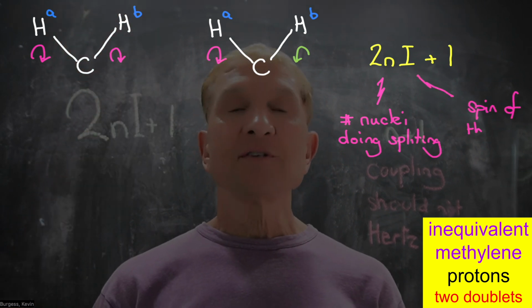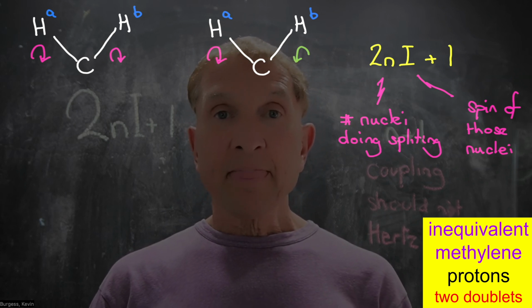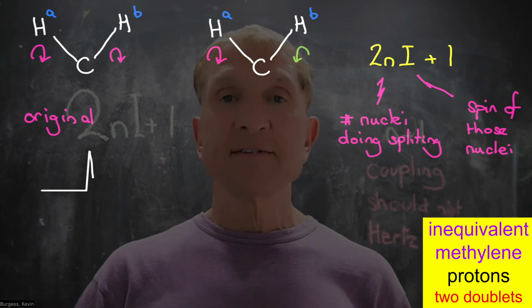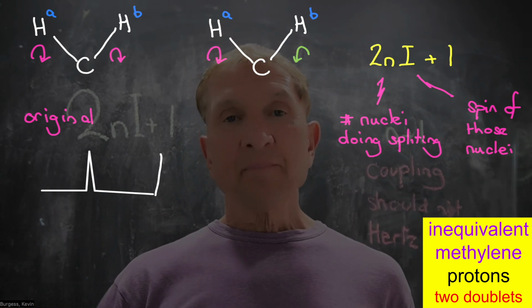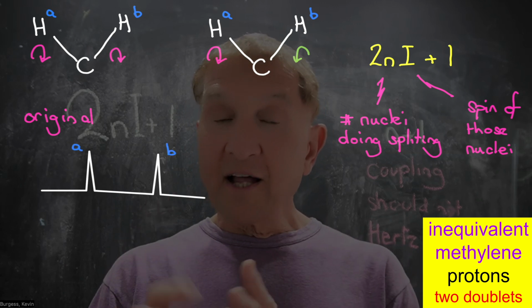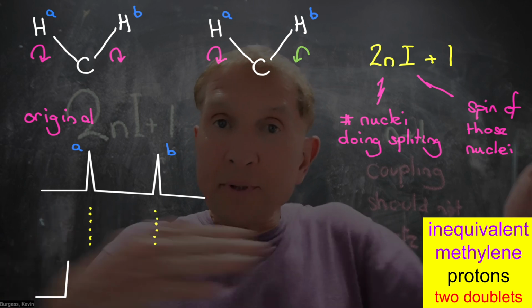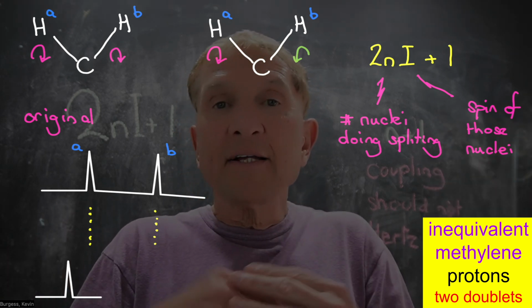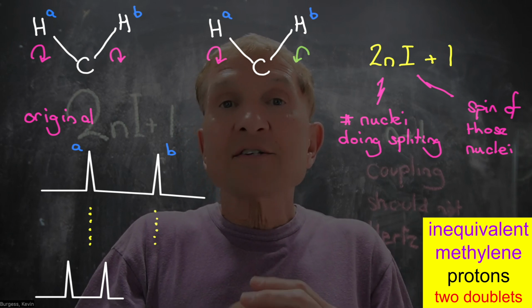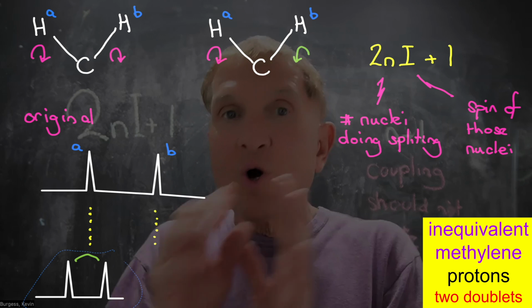Now the two protons are in the big magnetic field of the spectrometer, B0, and their nuclear spins align or oppose this. This can happen in two ways. HA and HB can both be aligned, or one can be aligned and one can be opposed. Therefore, perpendicular pulses applied to flip the nuclei between their populated levels are slightly different according to whether the other proton is aligned or opposed.